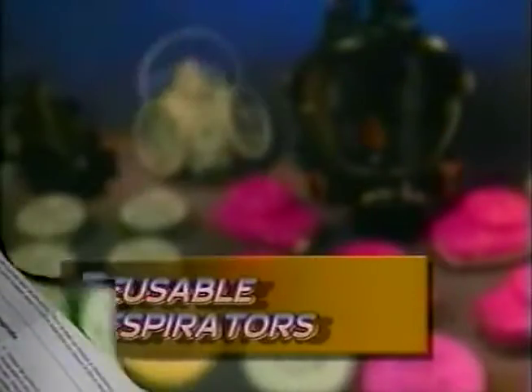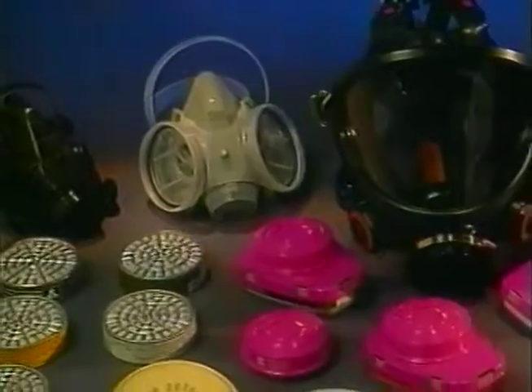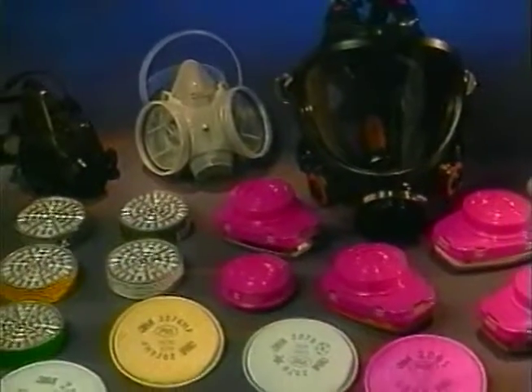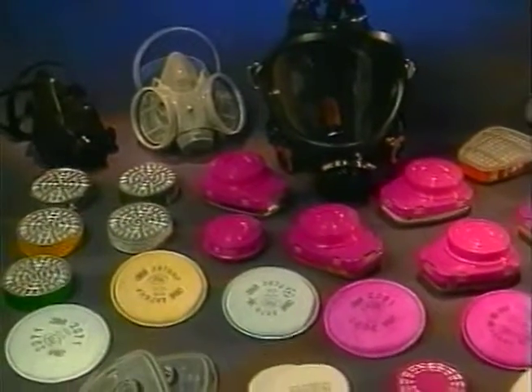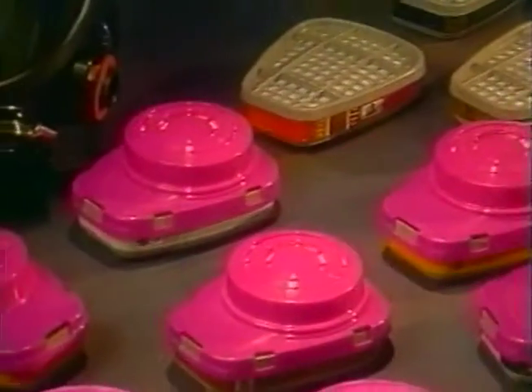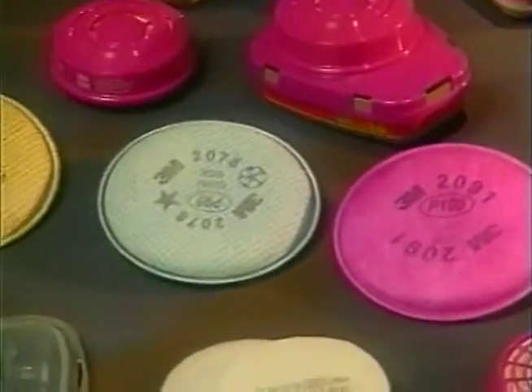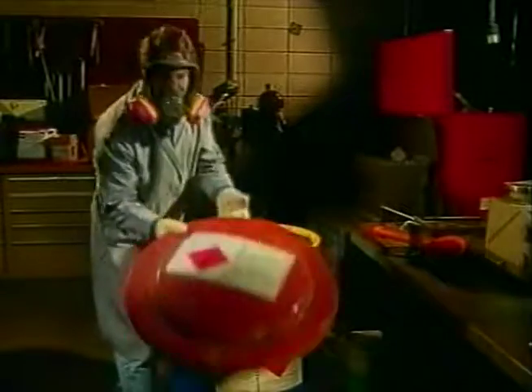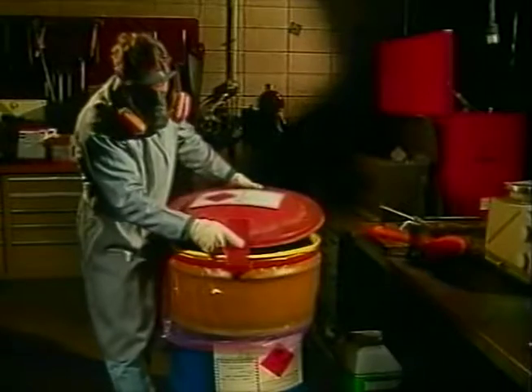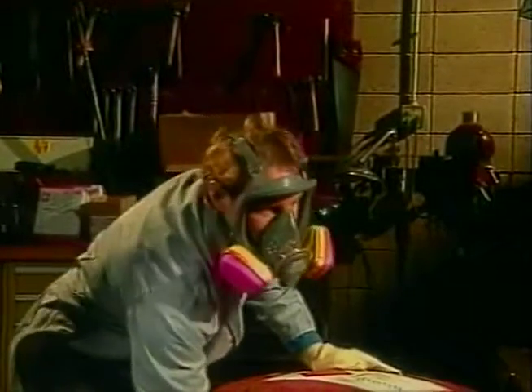Reusable respirators are usually made of molded plastics. All of these respirators are fitted with an exhalation valve. This type of respirator can either be a half-face type, covering the mouth and nose, or can be a full-face type protecting the eyes. The full-face respirator should be used when air contaminants are irritating to the eyes.